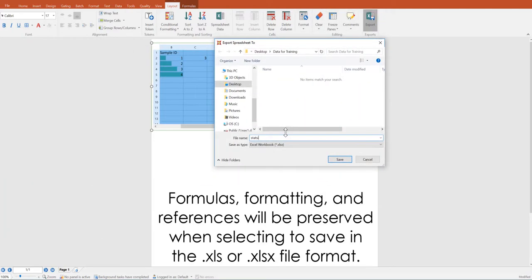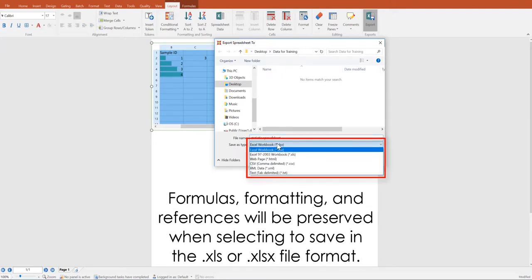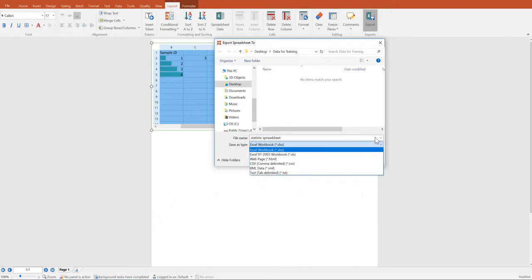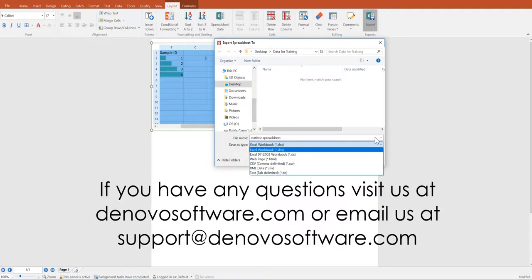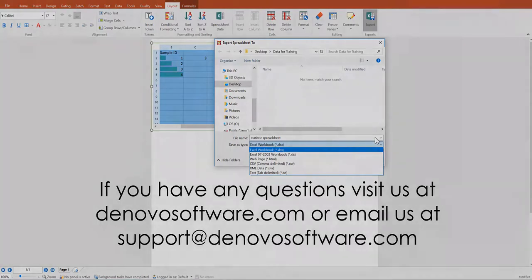Formulas, formatting, and references will be preserved when selecting to save in the .xls or .xlsx file format. If you have any questions, please visit us at denovosoftware.com or email us at support at denovosoftware.com.